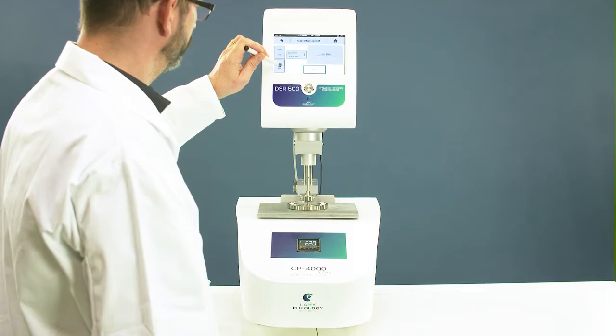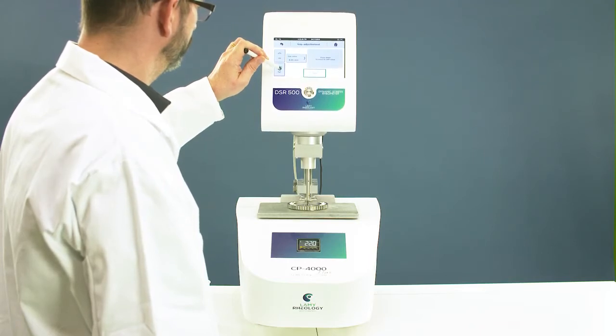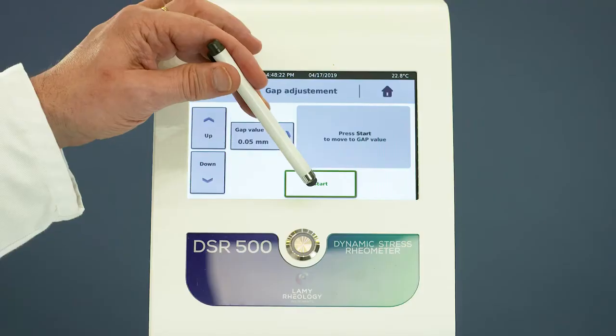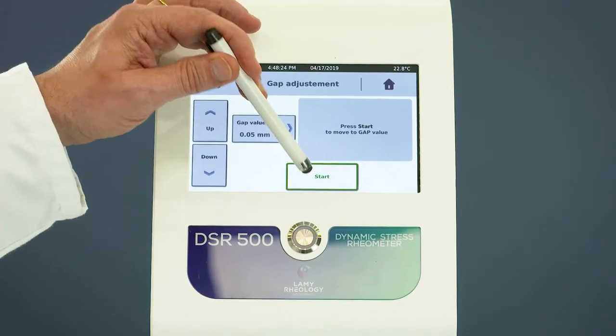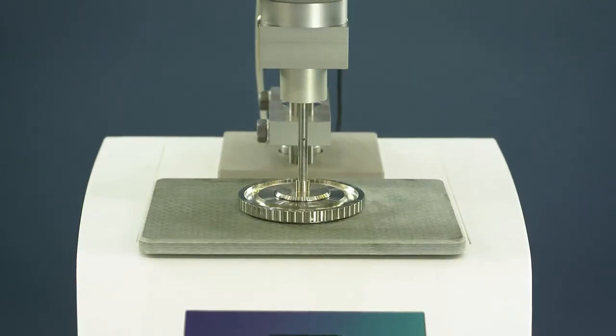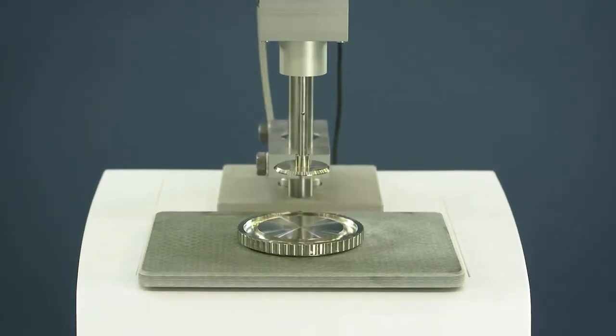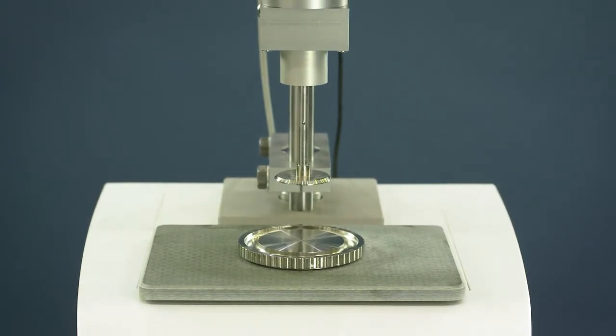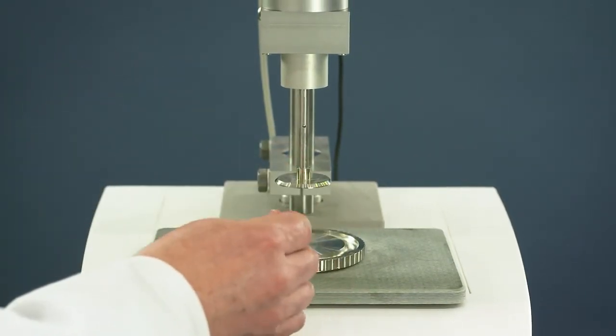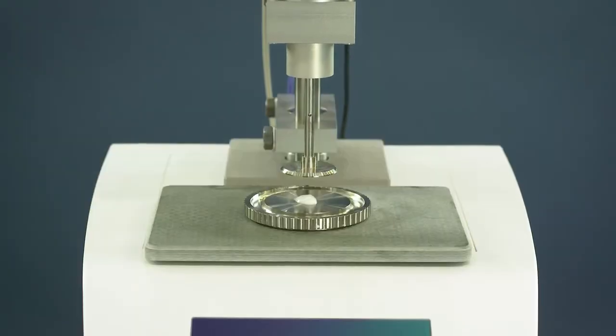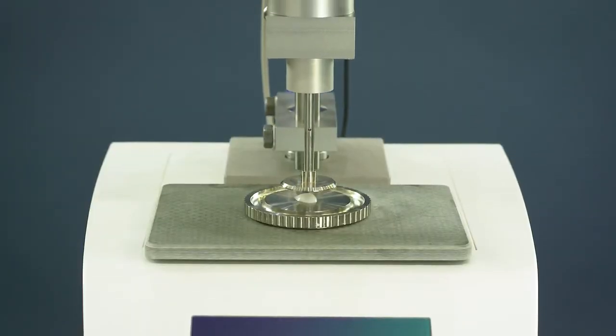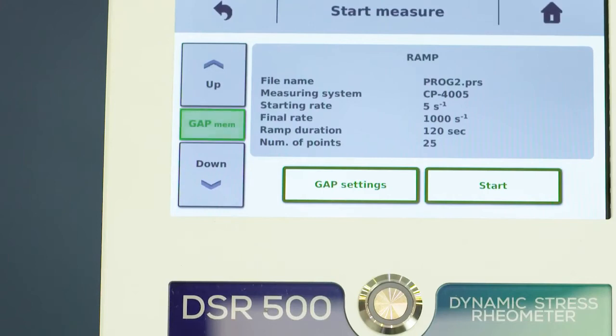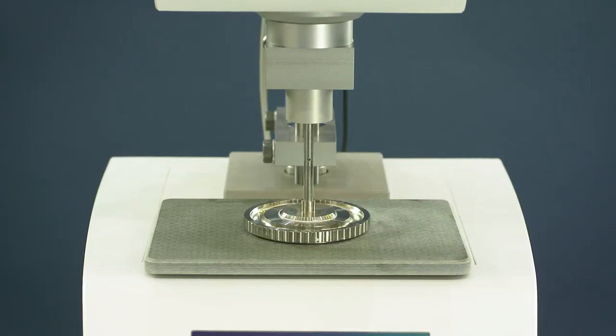Move down the head closer to the bottom plate and click start to set the zero gap. Move up the head with the lift functions and place your sample. Move down the head closer to the sample and click the gap mem function to reach the measuring position.